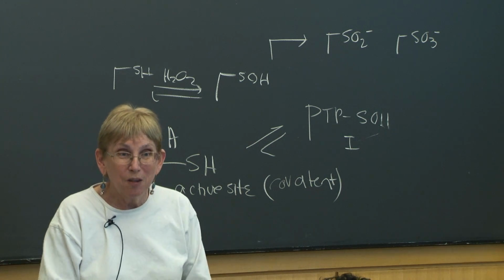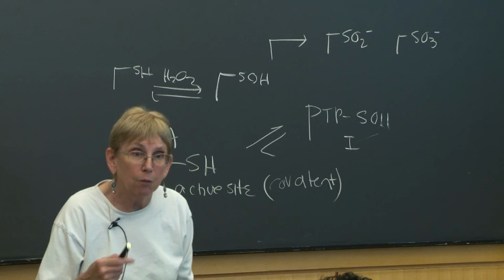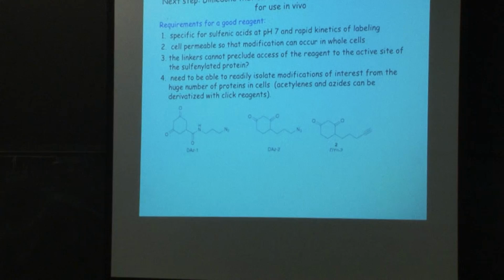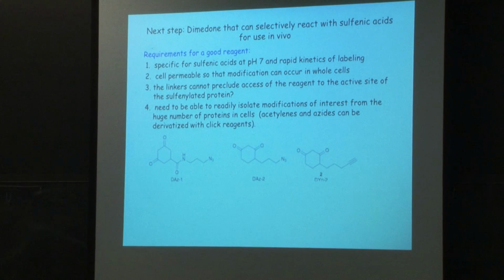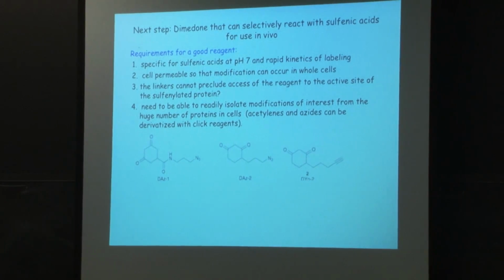So designing the experiment to be informative is, in my opinion, not trivial. So looking at the details is key, and you need to know a lot about the system, which I don't know anything about. And then, this has got to be able to get into the active site. So the active sites have got to be big enough. We know it can do that in glutathione peroxidase and GAP dehydrogenase. We looked at that. But this needs to be long enough.